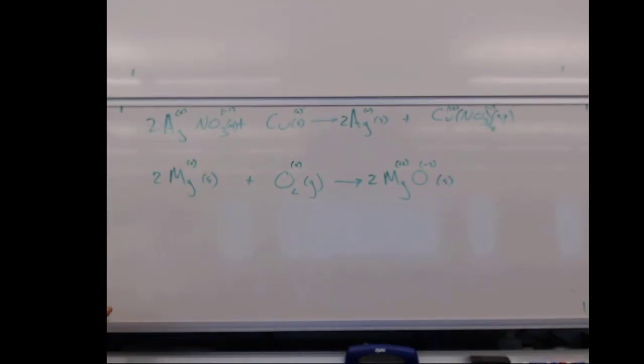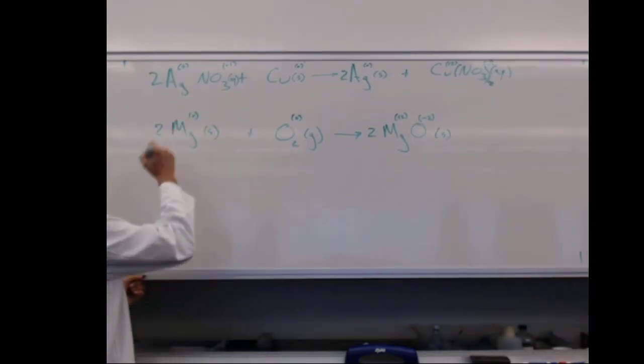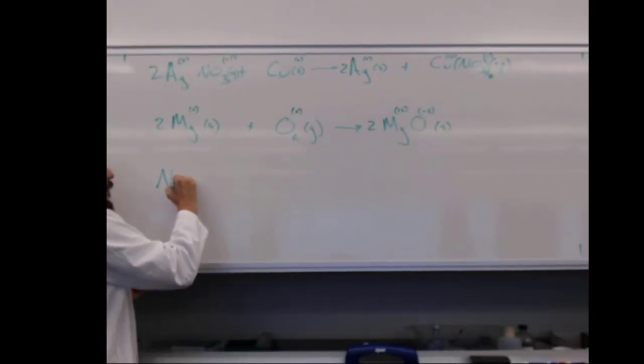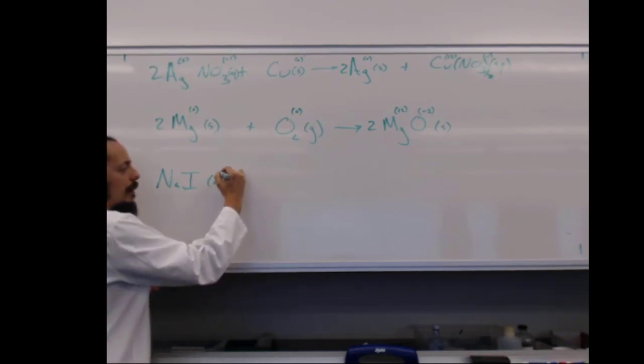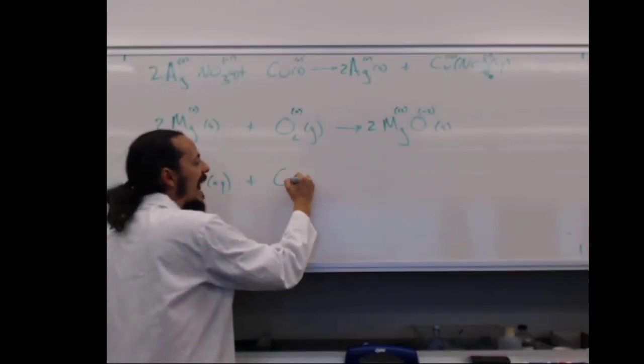The last one I want to look at, because I think it's really interesting, we'll do this one on the video as well, is sodium iodide, which is aqueous, plus aqueous chlorine.